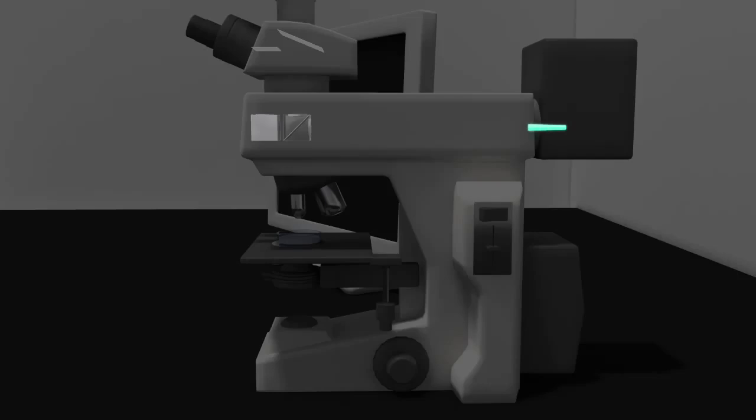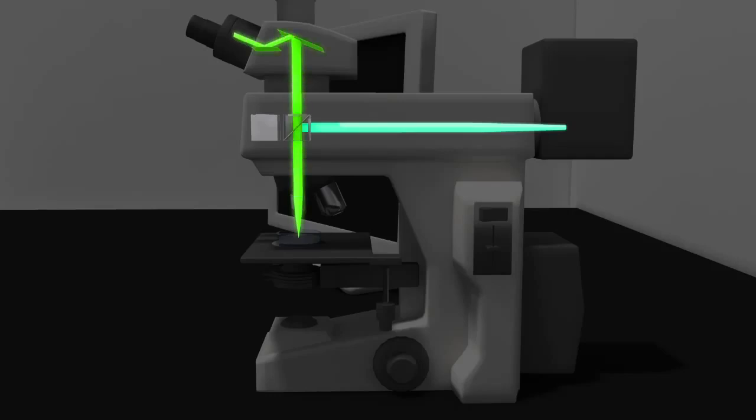From the laser light source, the excitation laser beam travels through the filter cube, which is used to provide the appropriate wavelength of light to excite the fluorescent molecules, or fluorophores, used in the sample, then through the objective to focus the laser light on the sample. The light emitted from the sample is then reflected back through the objective and the filter cube, which filters the emitted light to the camera or eyepiece where the researcher can view the fluorescent signal.